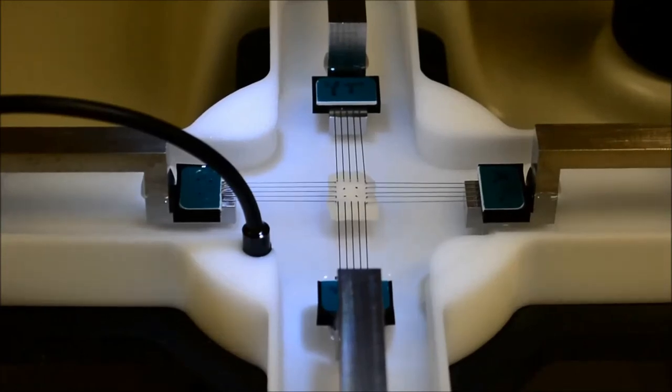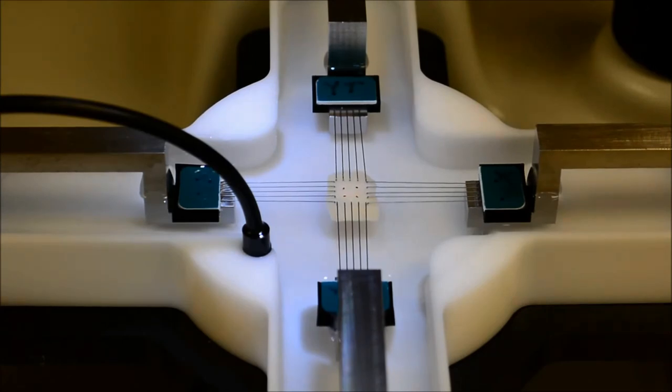Overall, we are quite happy with the Cellscale Biotester and support that we have received from the company, which includes hardware questions and software upgrades. We are happy to continue using the device as we are accumulating a large database of human artery mechanical and structural characteristics.